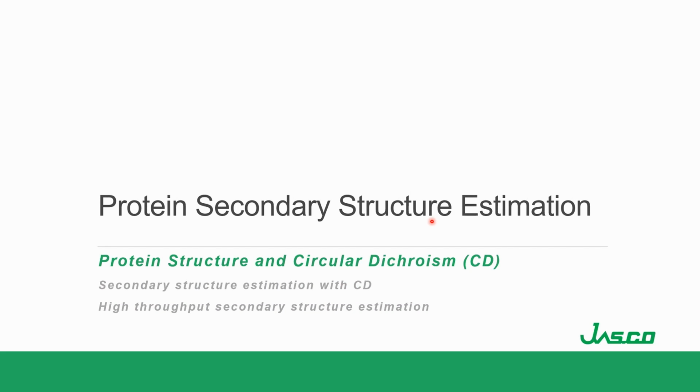All right. Yeah, thank you, Carlos, for that really excellent description of protein structure, and then how IR is used to determine the secondary structure of protein. So in my section, I'll be going over secondary structure estimation through circular dichroism, or a CD standpoint. I'm going to give a really brief overview of protein structure, mainly as it pertains to CD, since Carlos has given an excellent description of how proteins are ordered. And then after that, I'll get into how secondary structure estimation with CD works. What we'll find there is that it's really analogous to what's done with the FTIR, which is one of the strengths of having this in-house algorithm that we have.